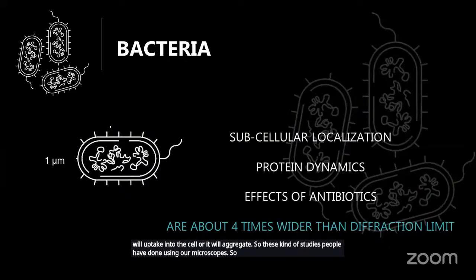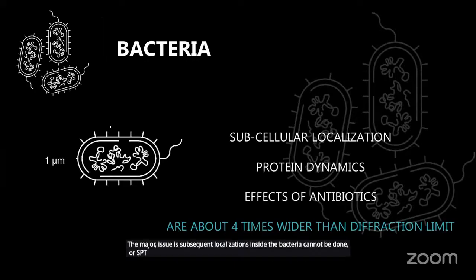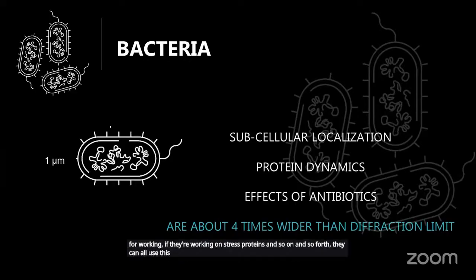Coming to the bacteria part, the major issue is that subcellular localization inside the bacteria cannot be done, or SPT. People struggle to do SPT inside bacteria. If you want to track a particular molecule, what is happening inside, or do cell wall or membrane studies, or study the effect of antibiotics, people really struggle. Those who are working on stress proteins and so on can all use this to resolve their questions.